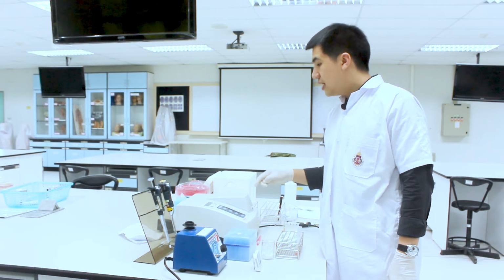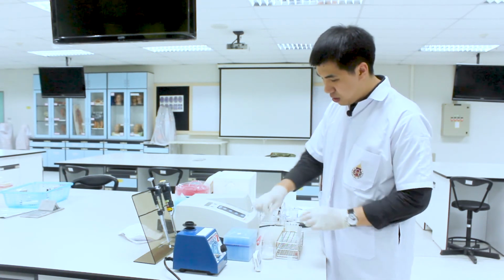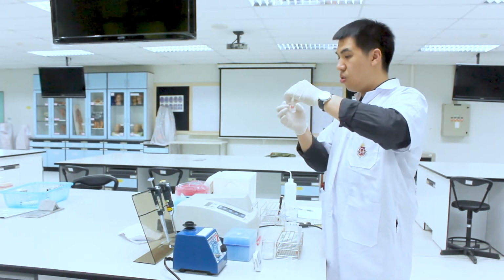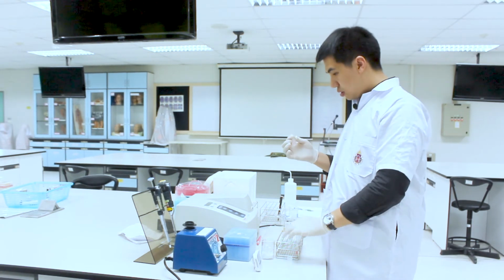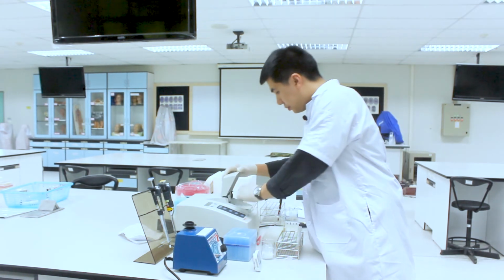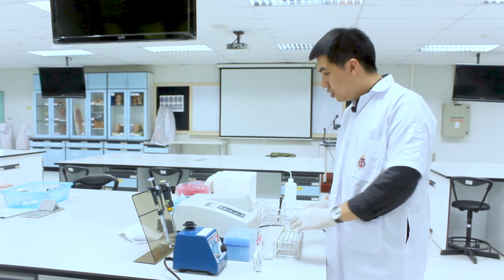You should see that the OD value here is 0 for the blank control. The second tube is the normal control. Now I got the OD value, and I will do the same for the rest of the four test tubes.